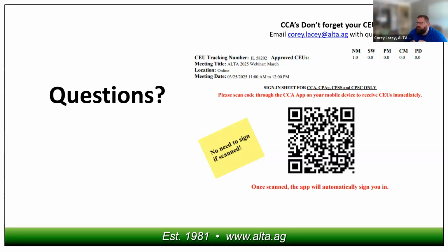Yeah, so a couple things I'm going to expand on that, and then I'm going to jump ahead one question because it's following up on the internal standard conversation. I know scandium is also a common internal standard used in our labs. One challenge that I think a lot of labs have, and maybe this is what the person asking the question is getting to, is sometimes the internal standard seems to actually be throwing off results, and I think it's related to speed or maybe how we have it set up.